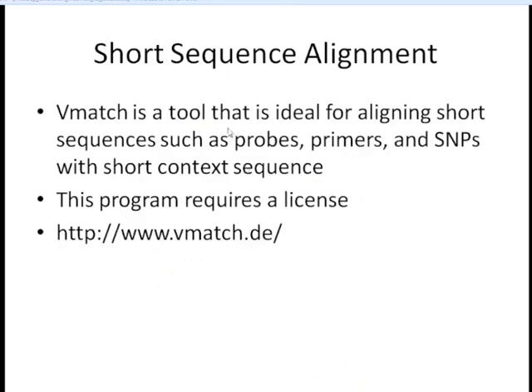The last specialized alignment topic is alignment of short sequences, such as microarray probes, primers, or short context sequence for SNPs. A very nice program for that is VMATCH. VMATCH requires a license and is not freely available, so I don't want to talk too much about it today. But if these are tasks you foresee yourself doing, I would look into using VMATCH.